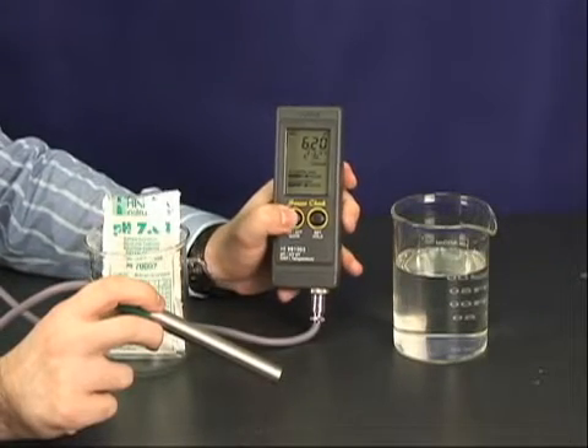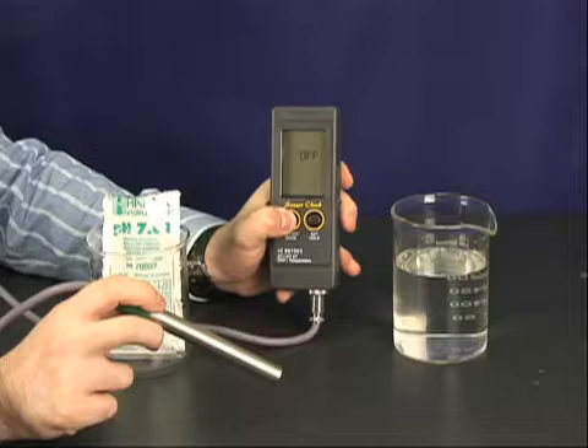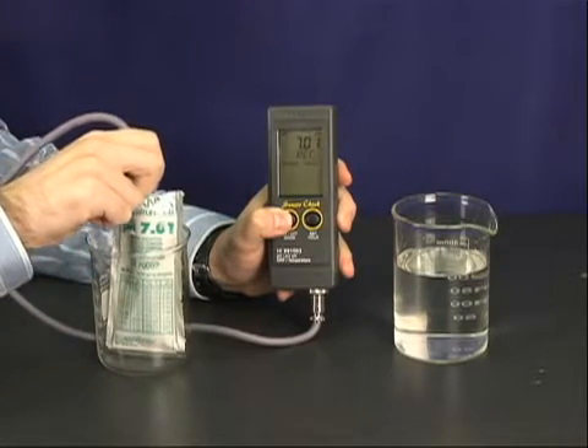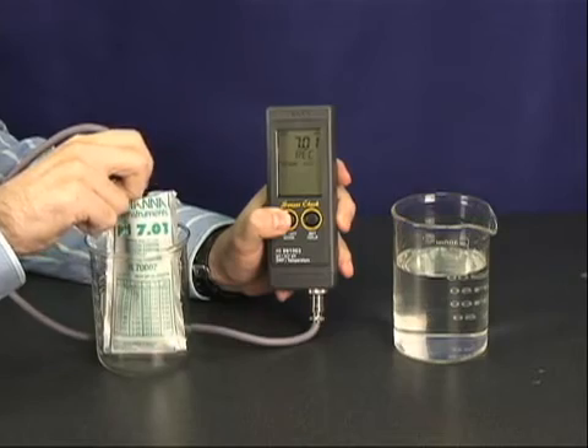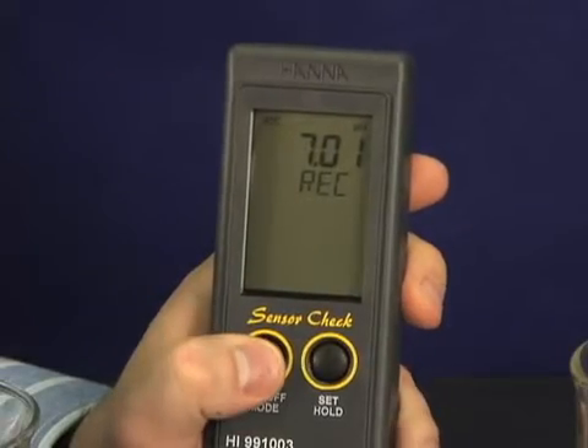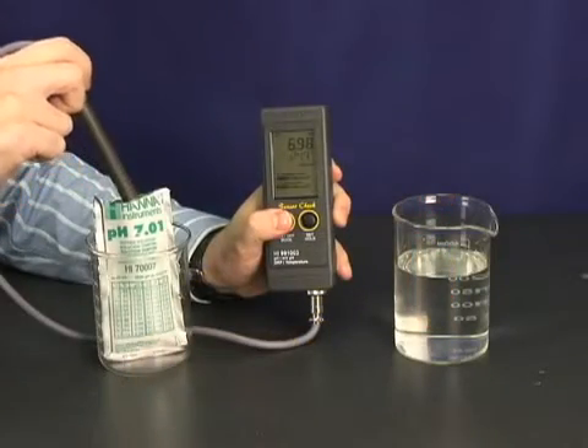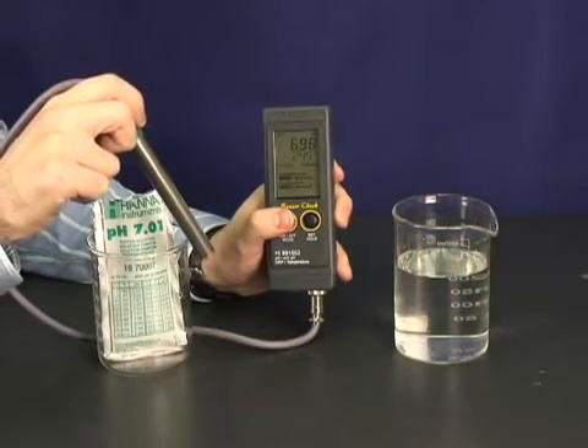To calibrate, hold the mode button down for 3 seconds until the meter prompts you to use 7 buffer. Then place the probe in the 7 buffer and calibrate. It's that easy. If you want 2 point calibration for enhanced accuracy, simply place in a 4 buffer solution next.